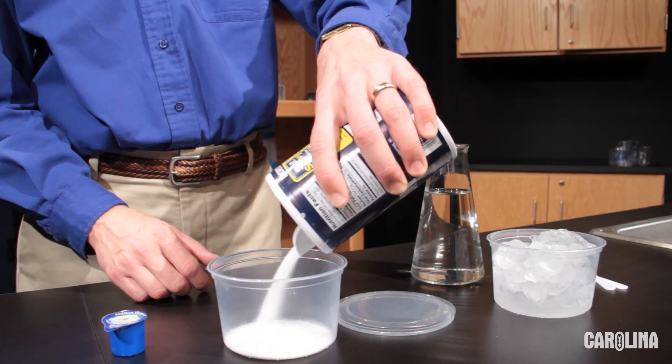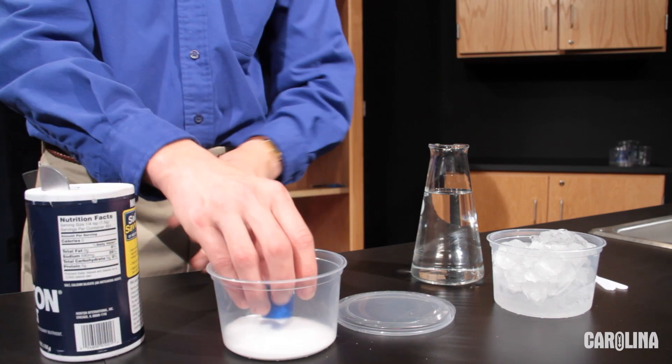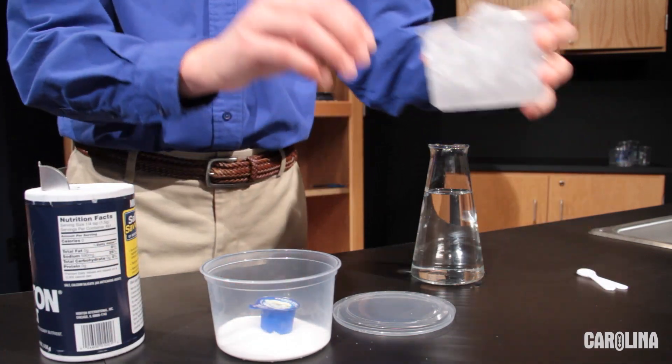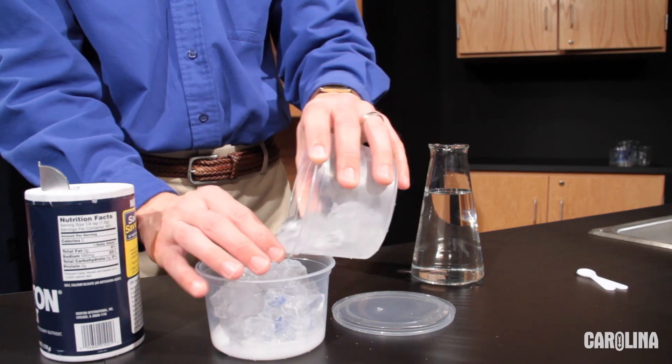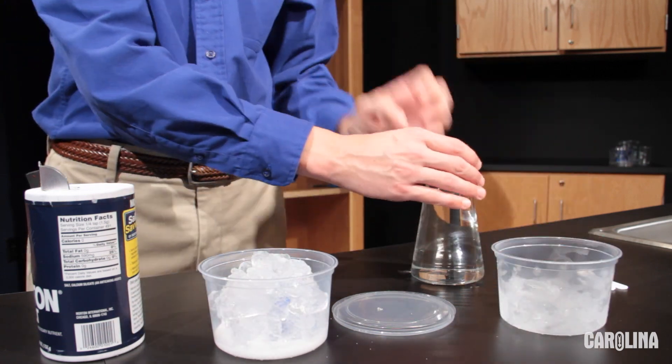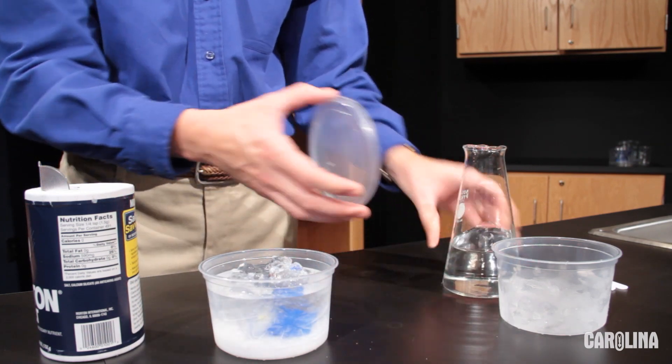Cover the bottom of the deli cup with sodium chloride to a height of about half an inch. Then place a single coffee creamer in the middle of the sodium chloride. Next, fill the cup with ice. Add water to the cup until it's full. Place the lid on the cup.